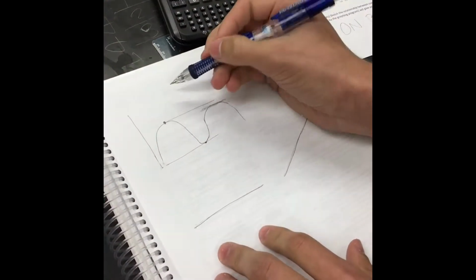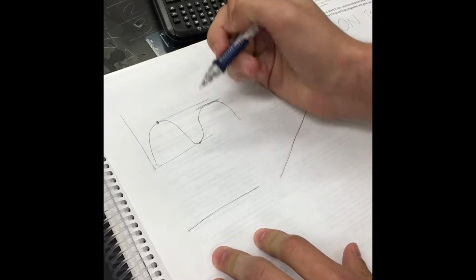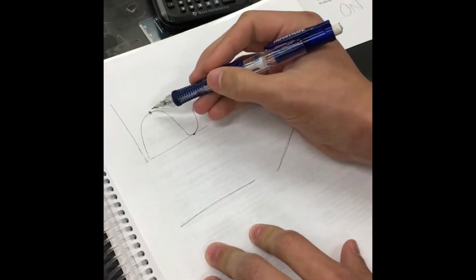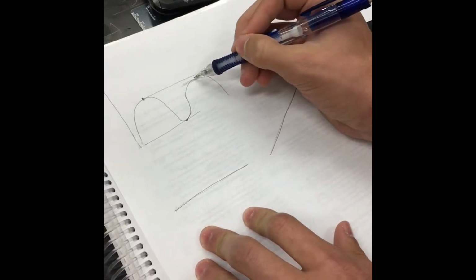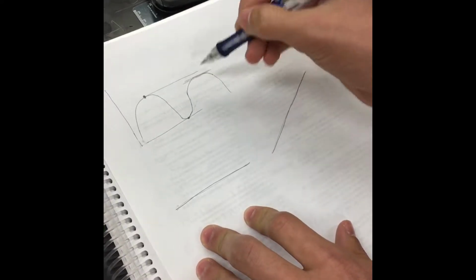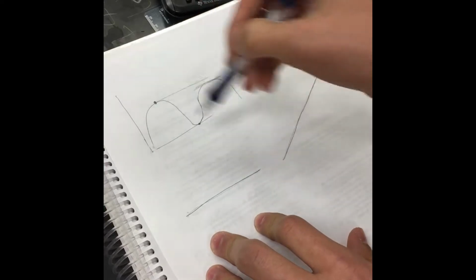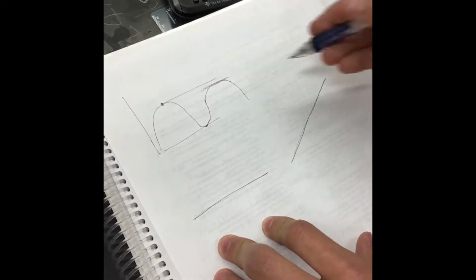In our two examples, we picked the lambda max and another point lower than that. Basically, we have to pick lambda max, which is the point of highest absorbance for the stock solution. Over here, it kind of looks like this one's the lambda max, but it's a local maximum. So it's not really the highest point of absorbance across all wavelengths.